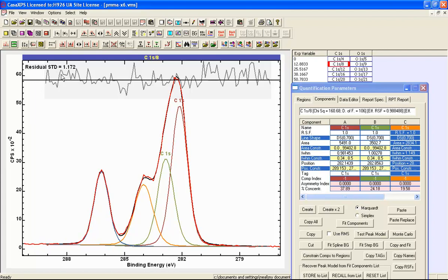We can also evaluate the data reproduction in terms of this residual itself, that we would look for a uniform distribution about the mean, and that would be an indication that we're producing a good data reproduction across the entire range of these data.